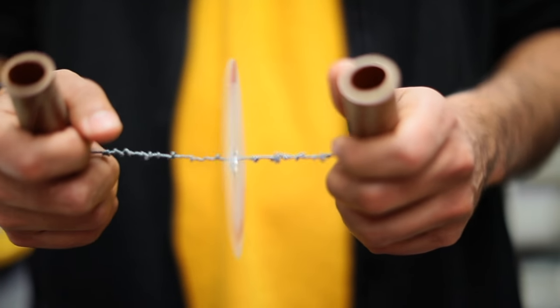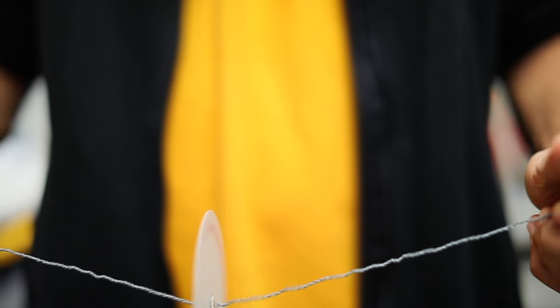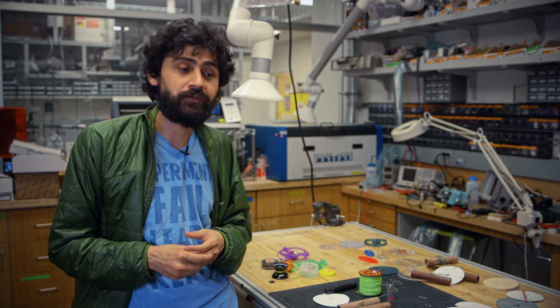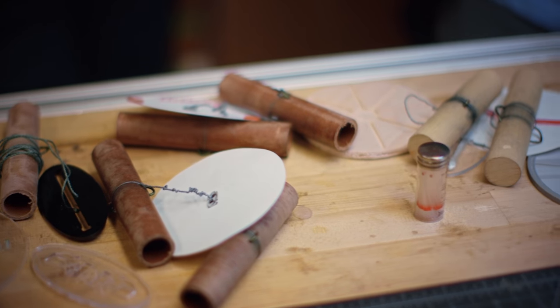With this set of principles, we're able to make a centrifuge that spins all the way to 120,000 RPM and 30,000 G-forces. In the lab, we can separate and pull out malaria parasites from blood. We can separate filaria, African sleeping sickness, and separate blood plasma.